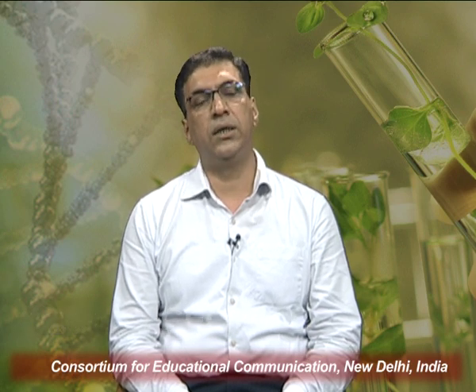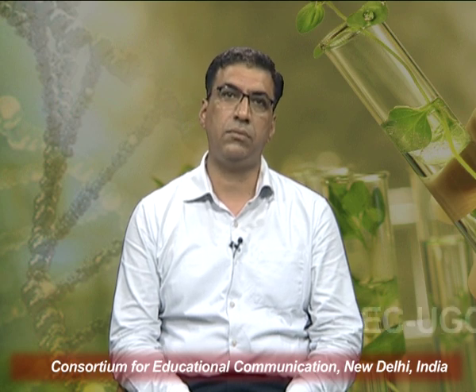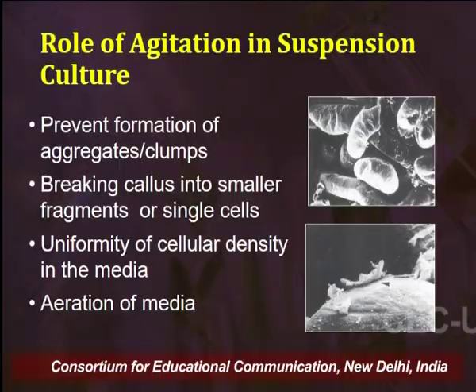Now, as we discussed, suspension cultures largely occur in liquid media, and therefore the liquid media has to be continuously agitated during culturing. Now, what is the role of agitation of this liquid media? The most important role of agitation is that it helps in preventing the formation of cellular aggregates or clumps.